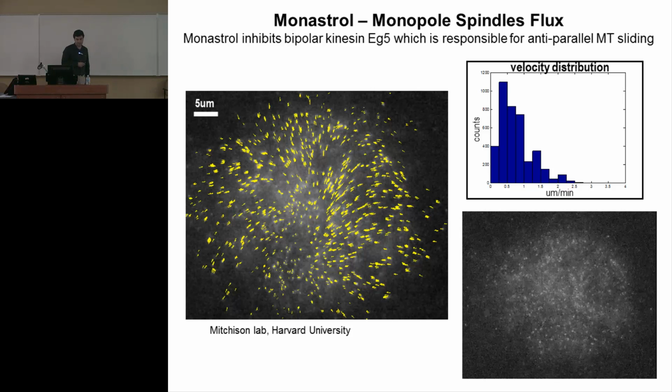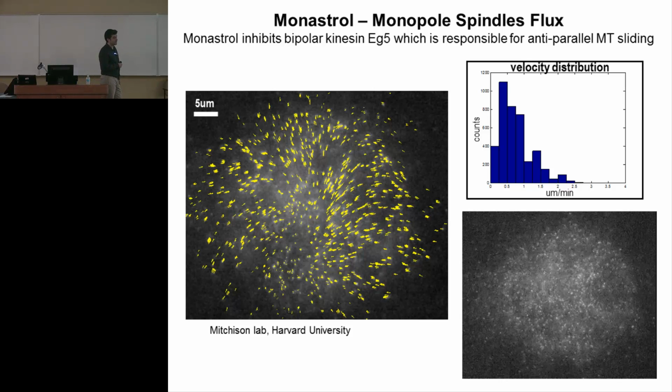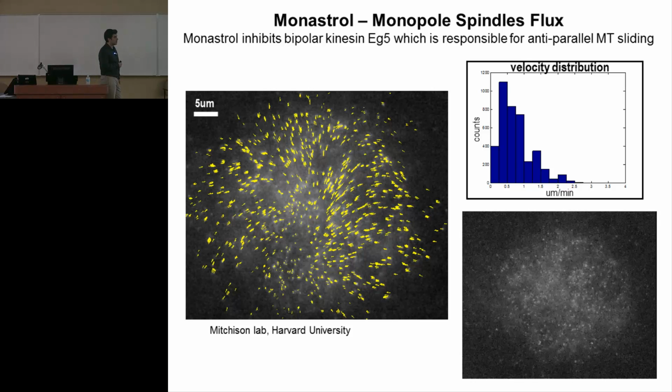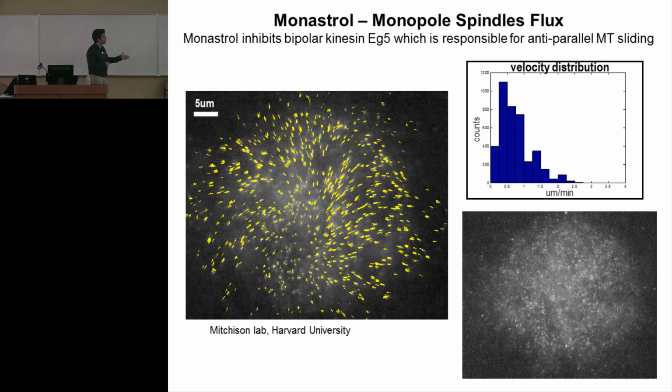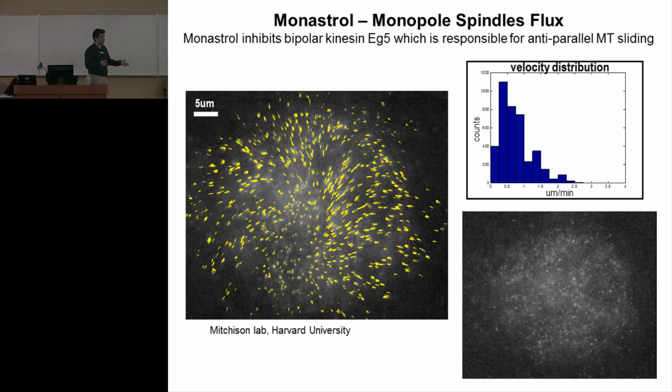Okay. In this one, is detection of these points much harder than tracking, or is tracking harder? I worked on 2 algorithms for detection. One of them was, for example, difference of Gaussians.